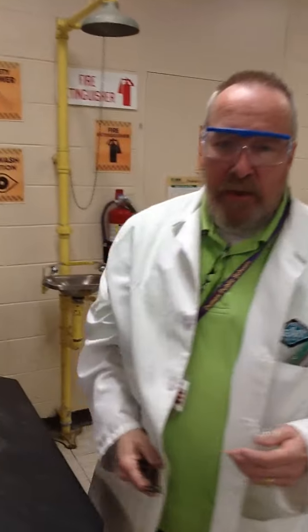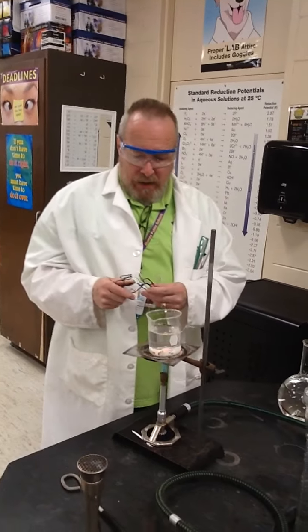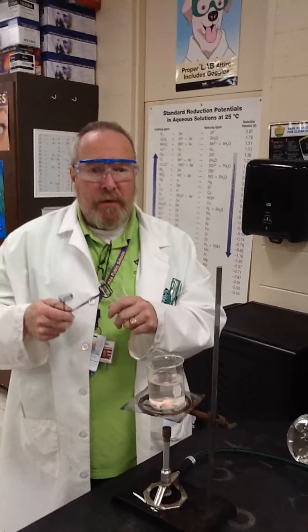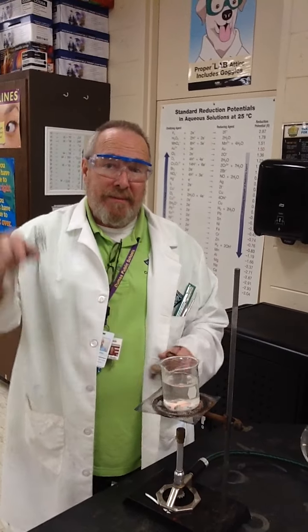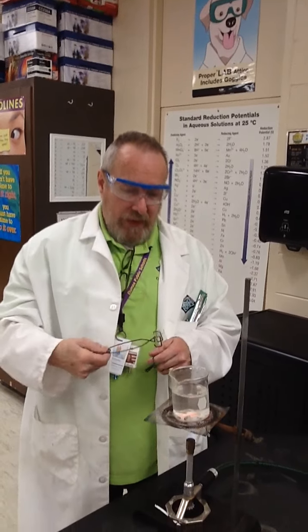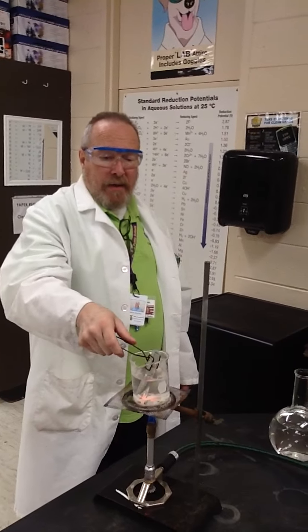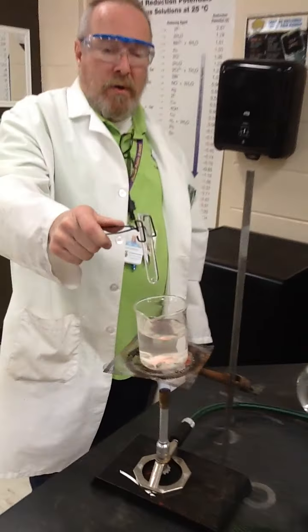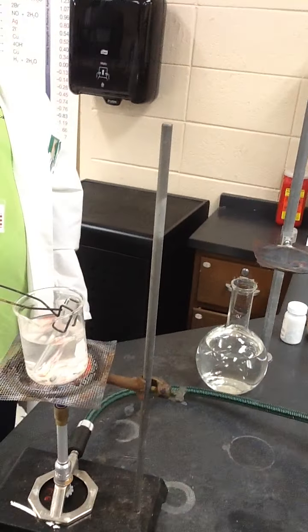So that we don't have to get ourselves too close to the flame, we're going to use a test tube clamp. Very simple device that keeps you an extra 3 or 4 inches away. Now I can set that tube in there. As that water boils, I can get it out, or I can set it in there and leave it there.